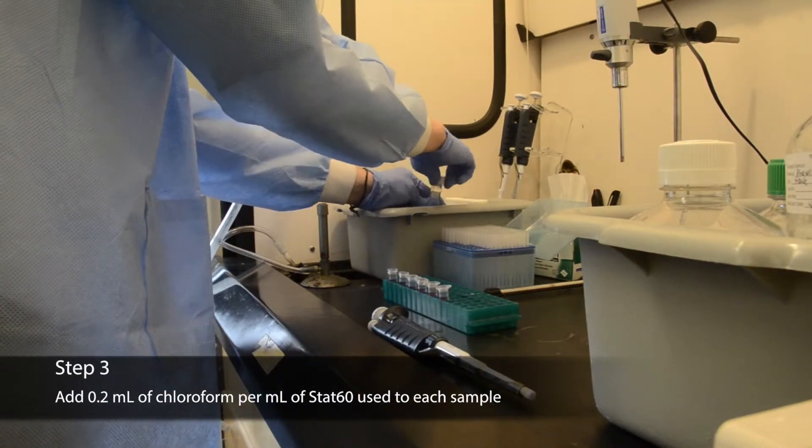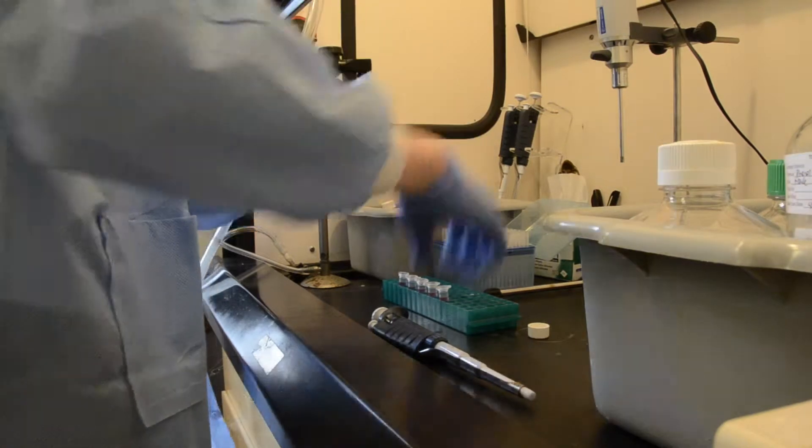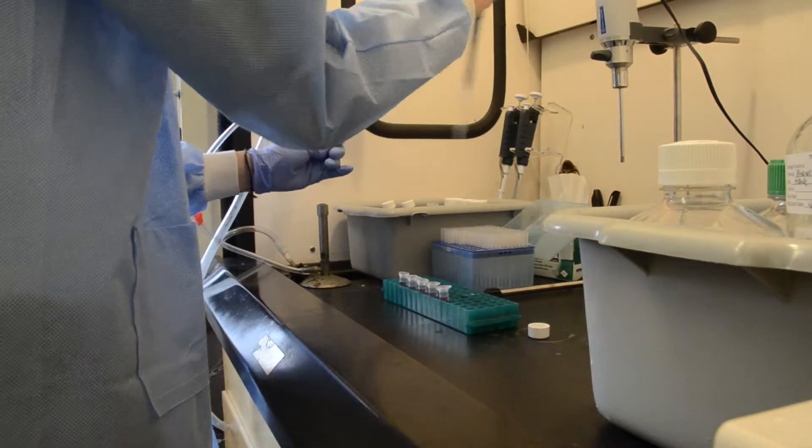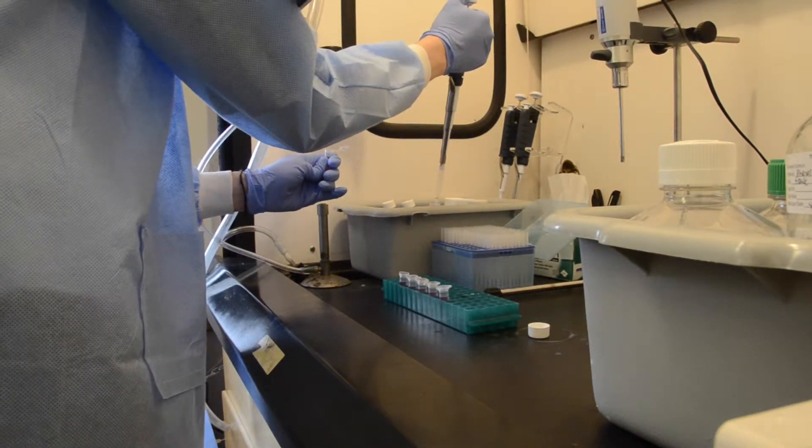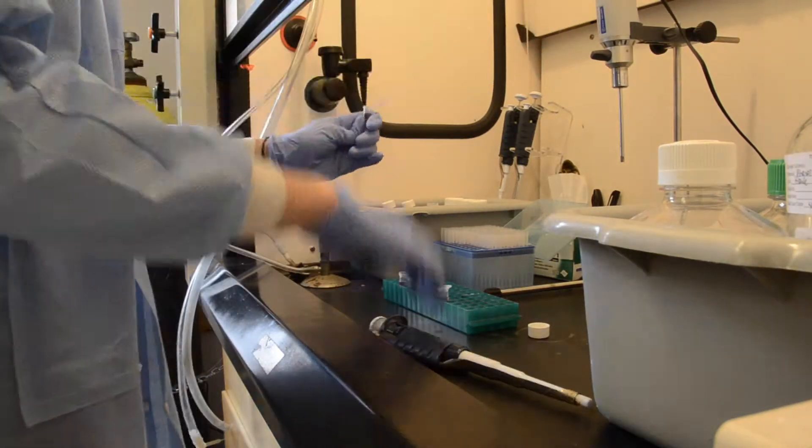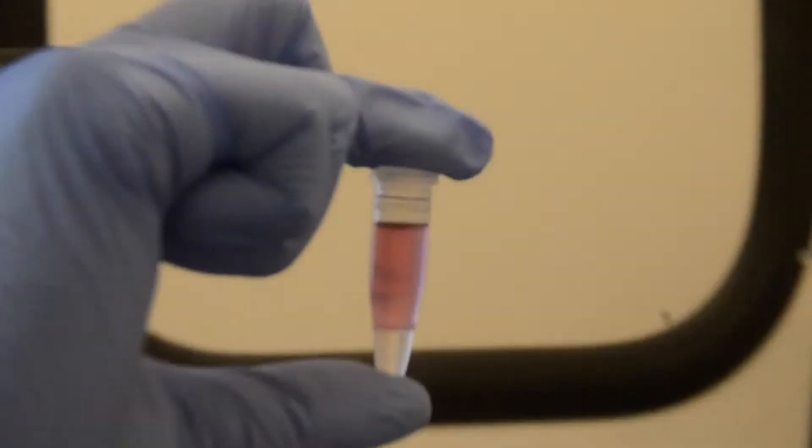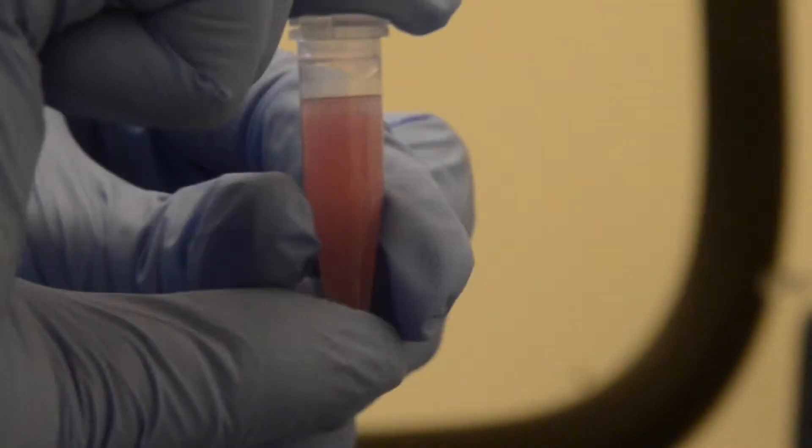Following the incubation, add 0.2 milliliters chloroform per milliliter of STAT60 used. Shake vigorously for 15 seconds and keep the sample at room temperature for five to six minutes. Chloroform is considered a hazardous chemical, so use caution when handling it and always work in the hood. The addition of the chloroform to the homogenate separates it into two phases, the aqueous phase and the organic phase.